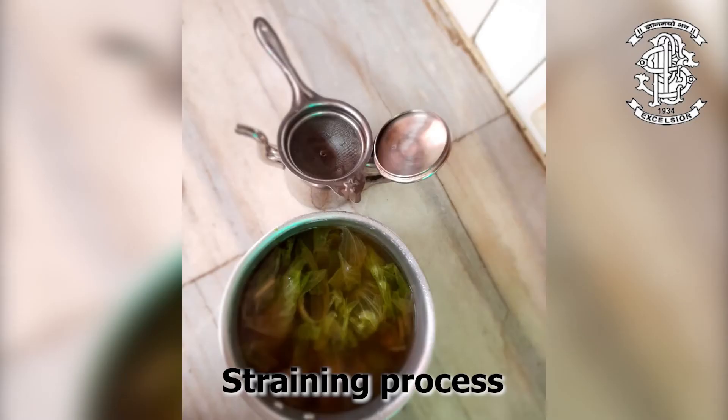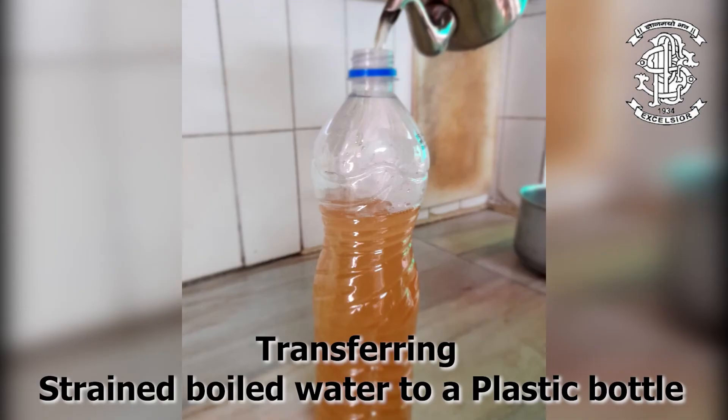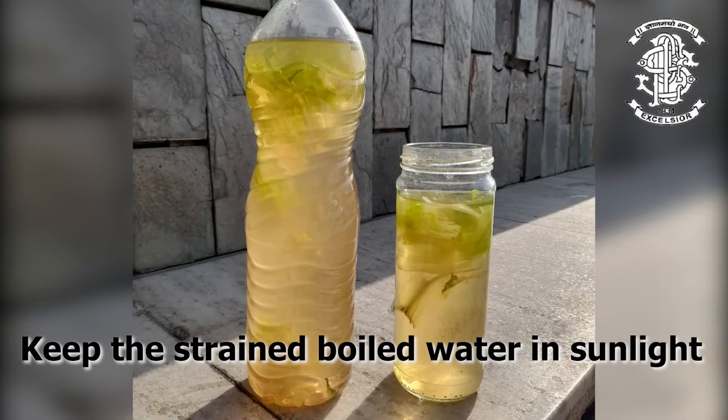After the lettuce was boiled with tap water, I strained the sample and added it to sample number 1. Next, I filled my containers — which included one plastic bottle and one glass jar — with the final sample. Next is waiting time.